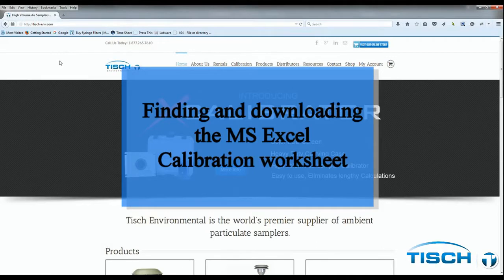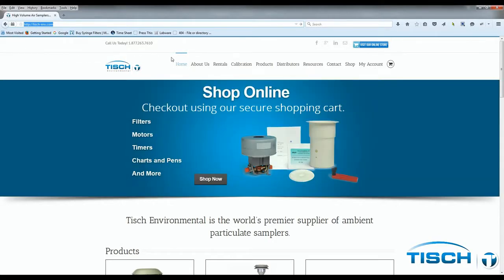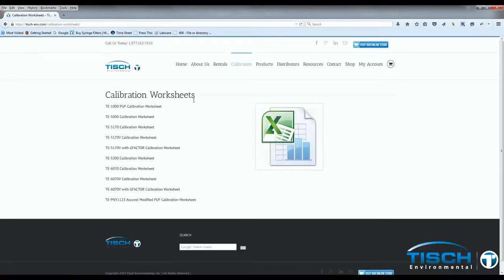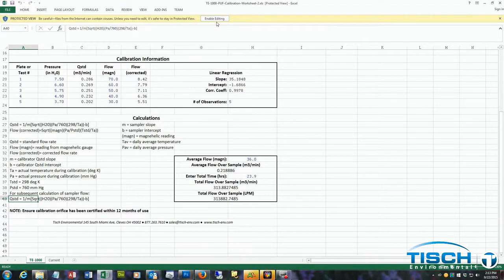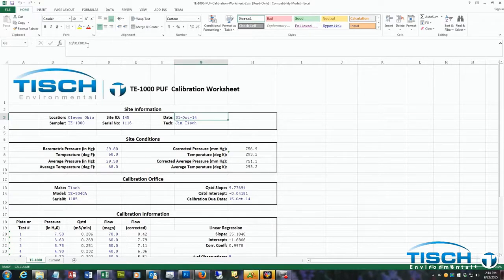You will need to go to tish-env.com to find the calibration worksheet for the TE-1000. Go to calibration, then down to calibration worksheets — the TE-1000 PUF worksheet will be the first one listed. Click on that link to download the Excel spreadsheet. You can put in your location, site ID, serial number, date, and technician.